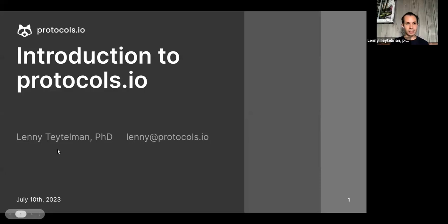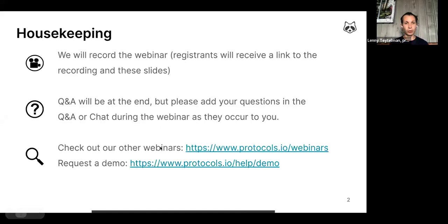Great. And we're on. So this is the introduction to protocols.io. If you're already someone who's been using the site for a while, you might want to check out one of our regularly scheduled more advanced webinars. You can take a look at protocols.io/webinars and all the different webinars that we offer on a regular basis. This is one for people who are really new to the platform and just recently created an account, haven't really played around with that. And I will go over the agenda in a second.